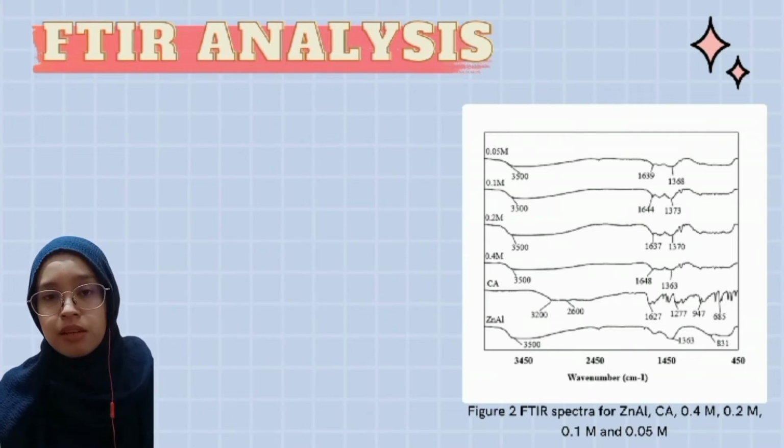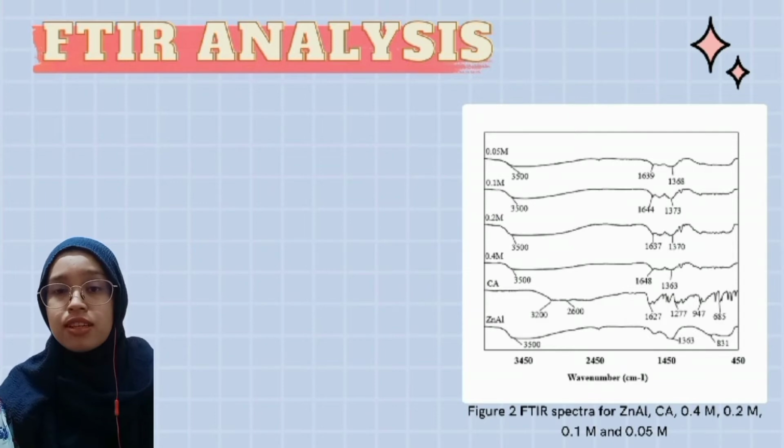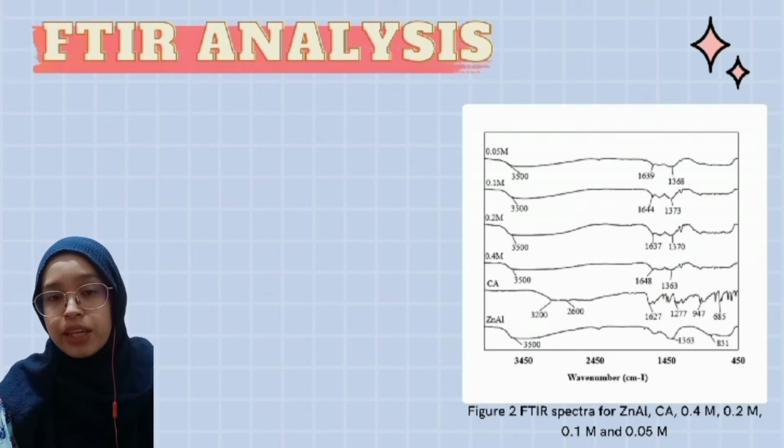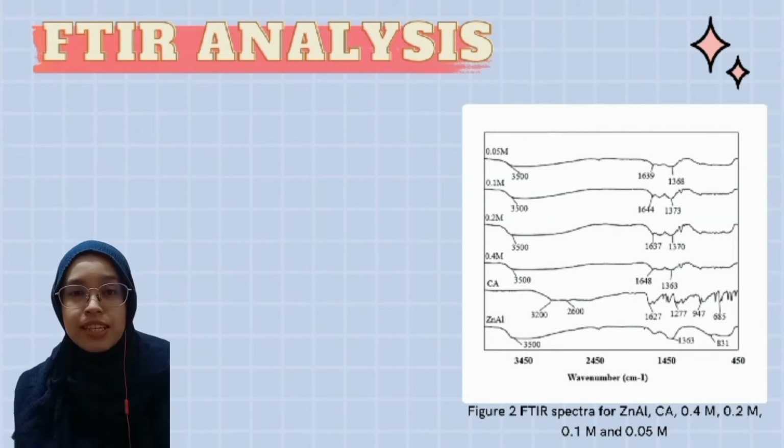So zinc aluminum LDH has shown a strong absorption band at 1363, suggesting the presence of nitrate in the zinc aluminum LDH, which we cannot see in the cinnamic acid spectra. But in the zinc aluminum cinnamic acid spectra, there's a significant peak at around 1363 cm-1, which indicates the existence of the NO stretching and the incomplete intercalation of the cinnamic acid. But as we can see from the zinc aluminum cinnamic acid samples, the nitrate peak decreased as the quantity of the cinnamic acid increased.